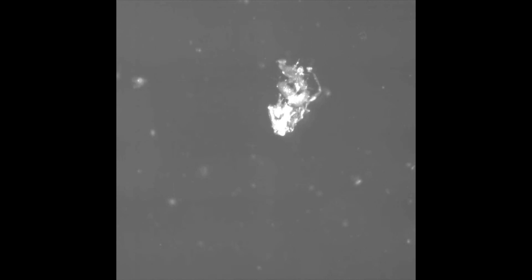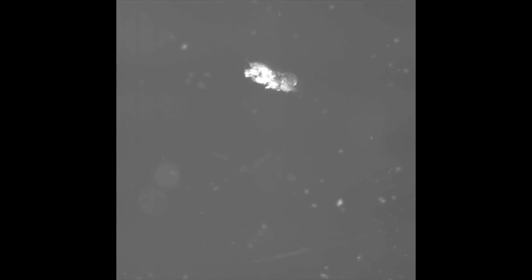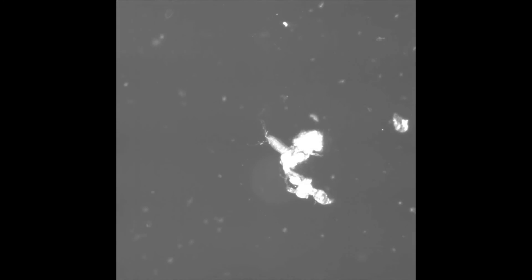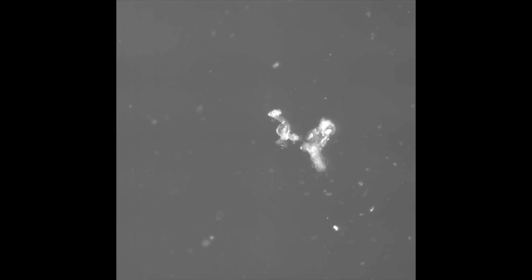This is a nicely stuck brain. If you did everything right, your cover slip should look something like this after several pulls. Look at all those brains!